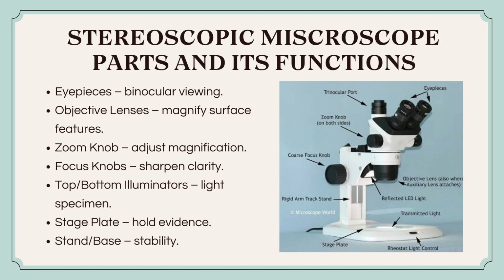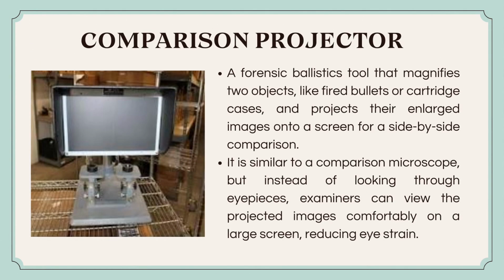The significance of this one also is that it is essential for initial analysis and documentation. It ensures evidence is suitable for comparison before using a comparison microscope. The third instrument is the comparison projector.